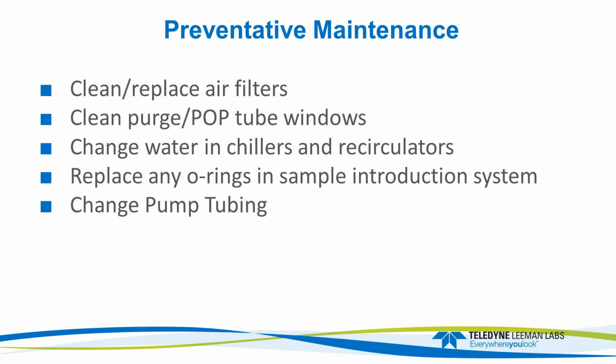Peristaltic pumps have come a long way. They're pretty resistant. Those rollers are tough. But if you just start putting 10% nitric or hydrochloric acid in there, you're going to run into trouble.